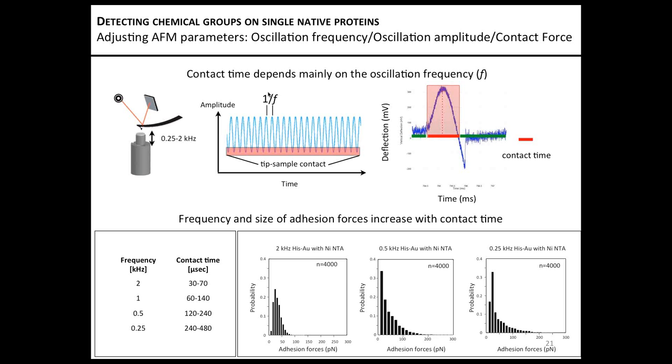This is, probably Sasha, you're more familiar with, why exactly you have to scan a little bit slower if you record all the PeakForce curves. Right. So the answer is that in high resolution imaging, as you've done, Moritz, you can scan a little bit faster, like you mentioned, 0.25. If you still want to capture the raw data file, the so-called PeakForce capture file, where all the force-distance curves are stored, then you need to decrease this value, because the system requires 4 taps on each place, and 1 force-distance curve is then saved at this position.